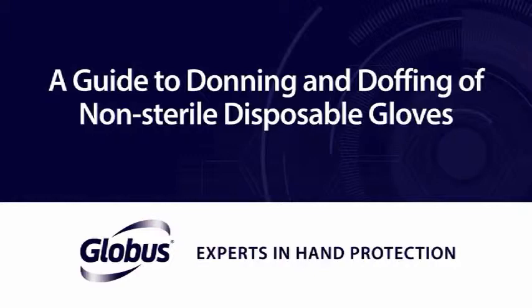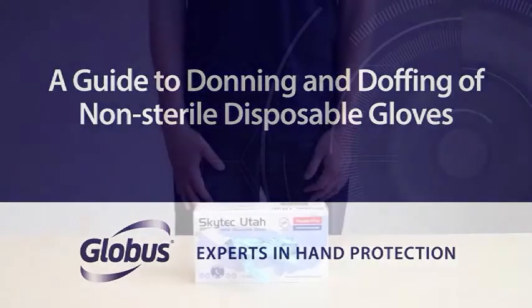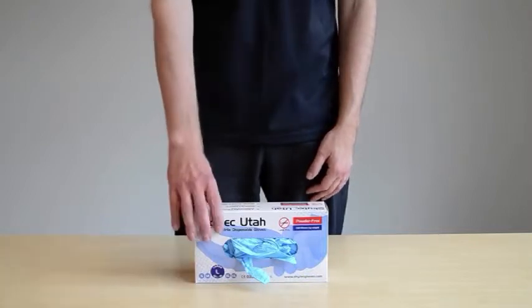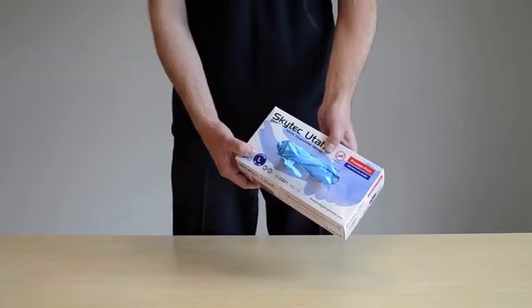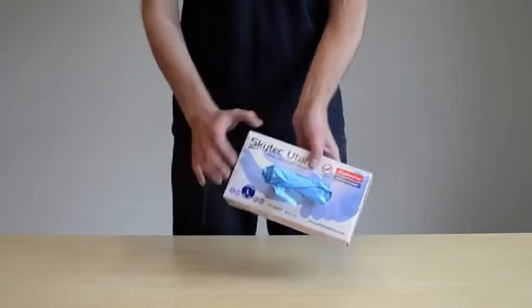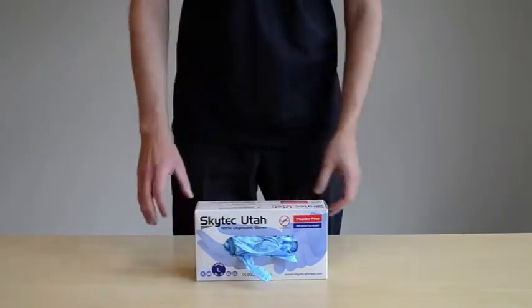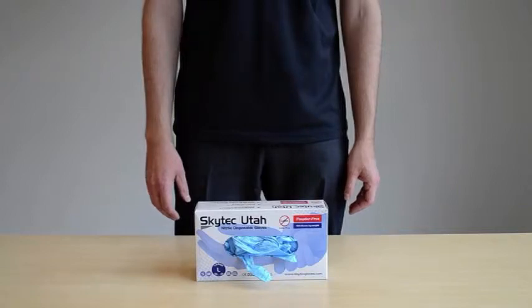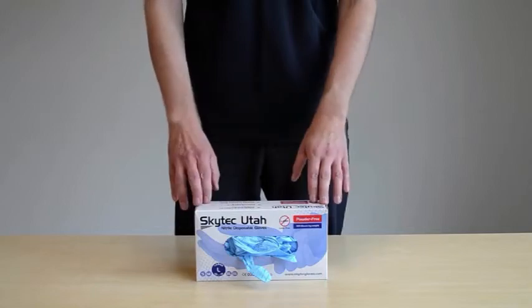This video gives an example of how to correctly don and doff disposable gloves. Before using a disposable glove, always ensure the right type is chosen for the type of work and potential hazards. Make sure the right size of glove is used. Measure your hand using a glove sizing chart. Wearing the right size will reduce the potential for tearing and also ensure freedom of movement for the hand. Remove any jewellery that may rip the gloves and wash your hands before donning gloves, as well as after each glove change.